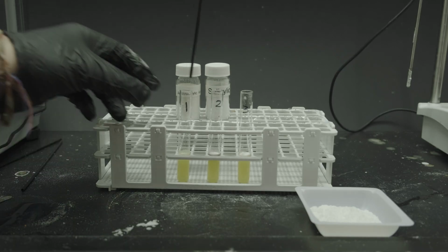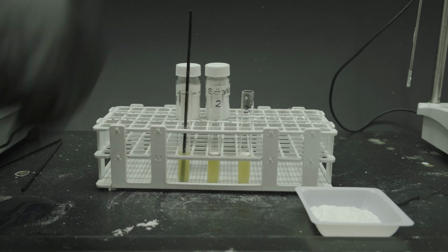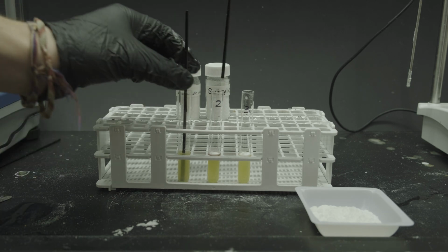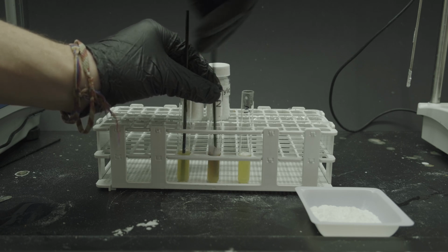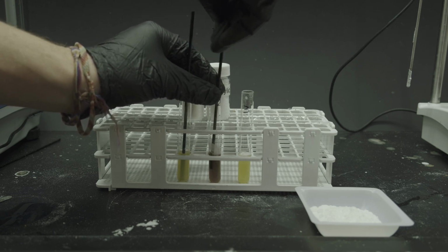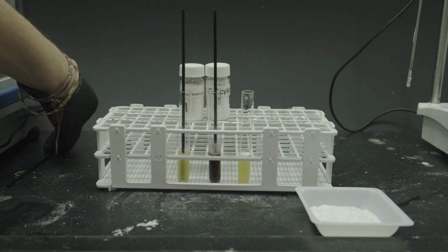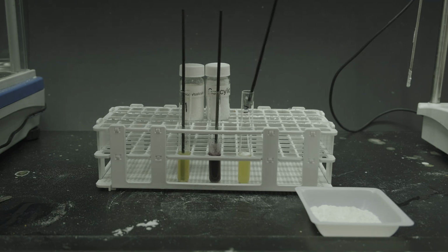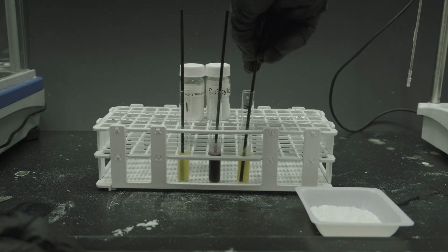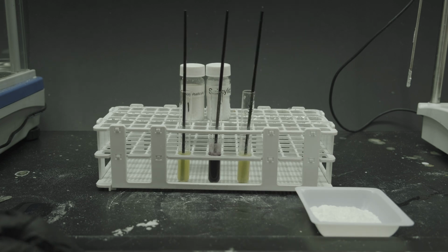I gave each test tube a good stir, and the first one came out orange. The second one came out a nice deep purple. And the sample that I had made, as you'll see, what would it come out to be? Well, this was the big moment to see if I had actually made aspirin. I gave it a stir, and nothing was happening. But this is exactly what we wanted.